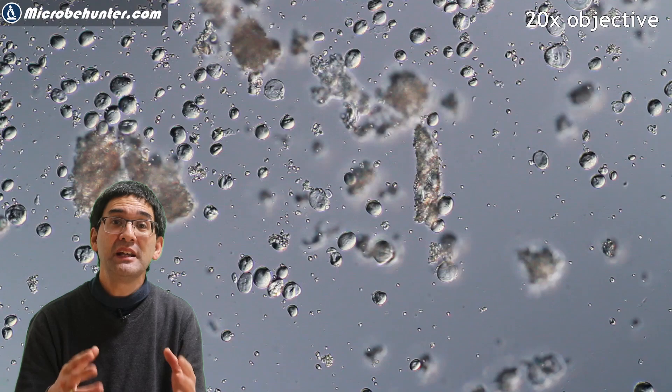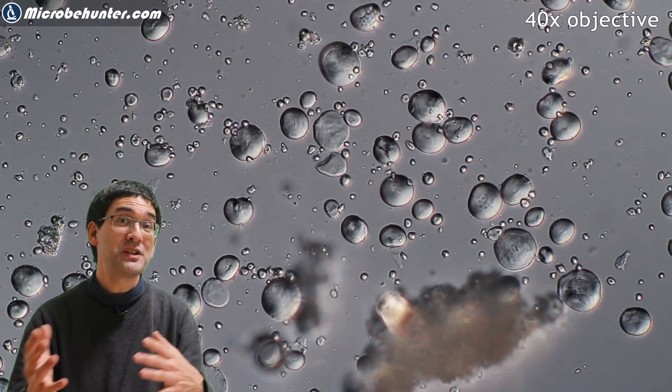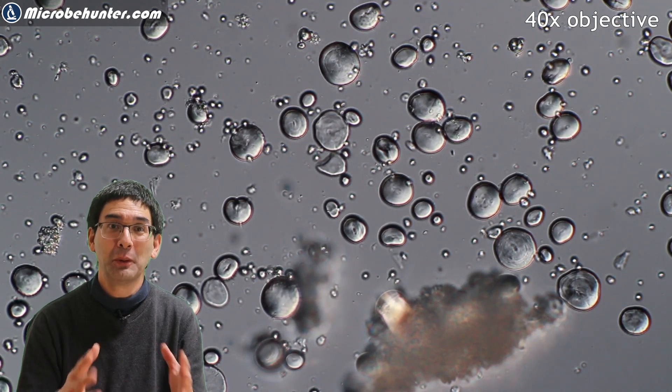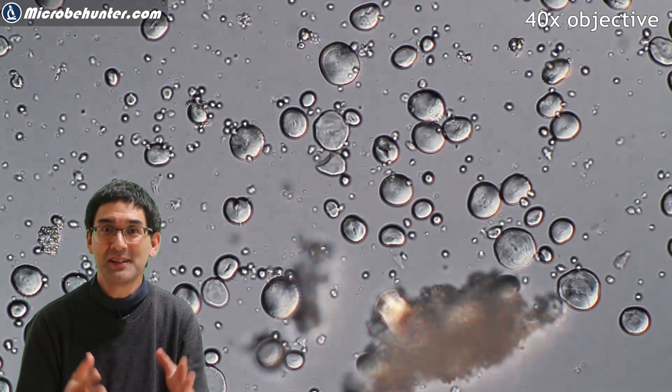I was also not able to see any hyphae, and I was not able to see any sporangia. So the white unidentified material on the bread probably was flour, and the bread is safe to eat.